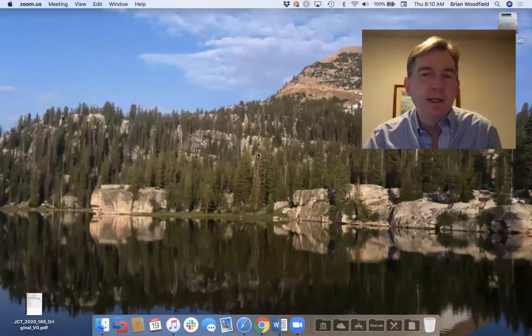So I'm going to go through and show you the lab. The first thing I'm going to do is show you how the client works and what's in the client. That's the one hurdle that students get over, I mean, maybe only 5%, 10% of the students. And then I'll show you what those labs are.